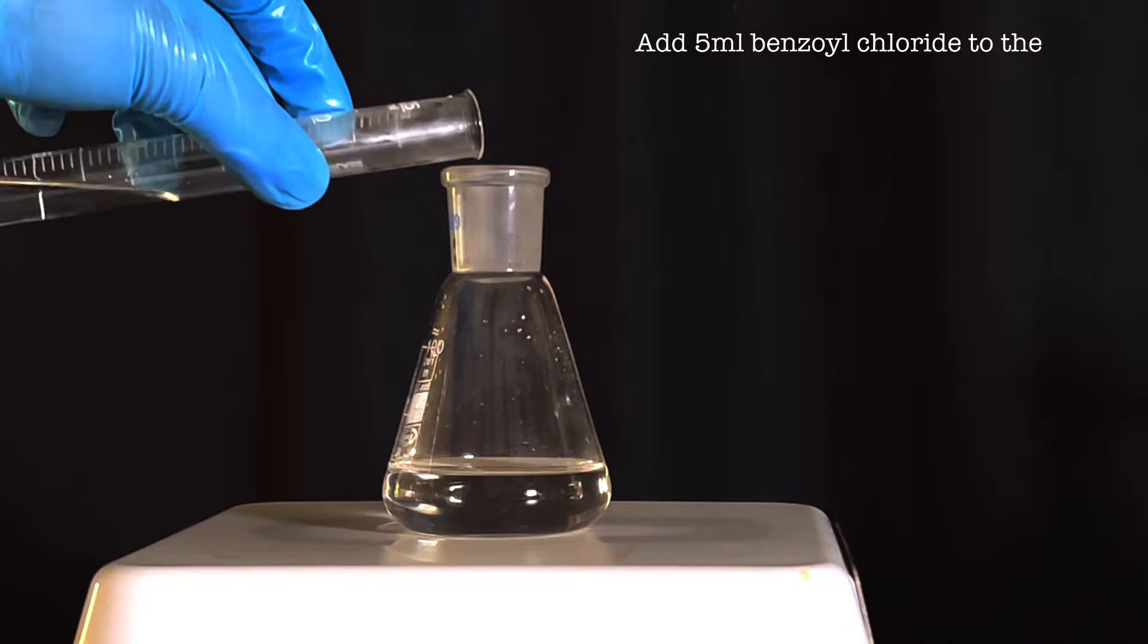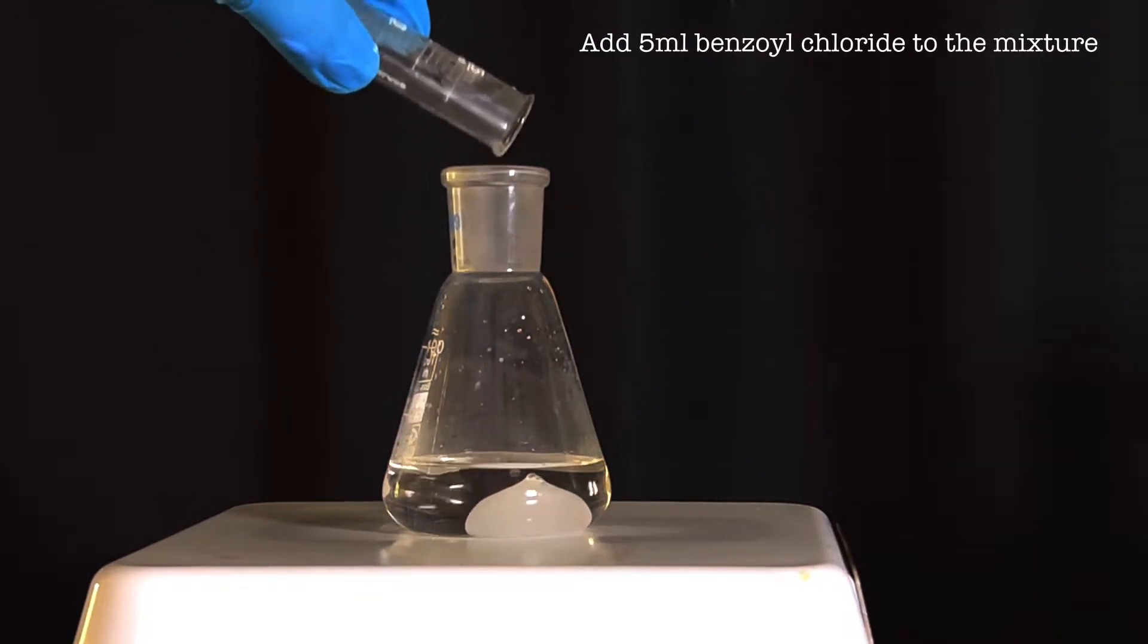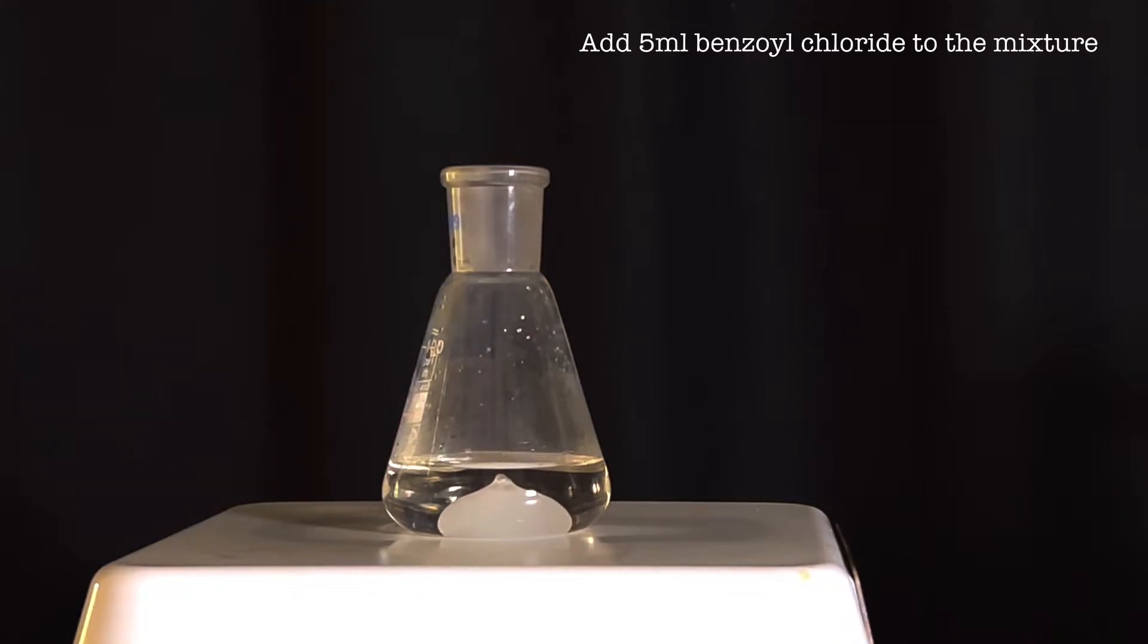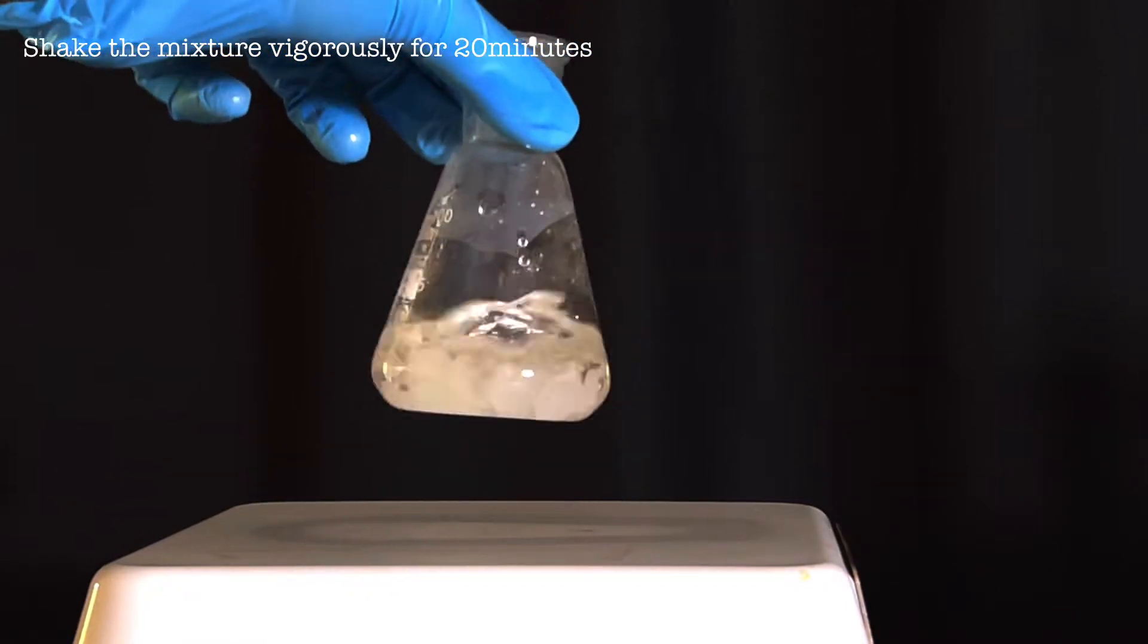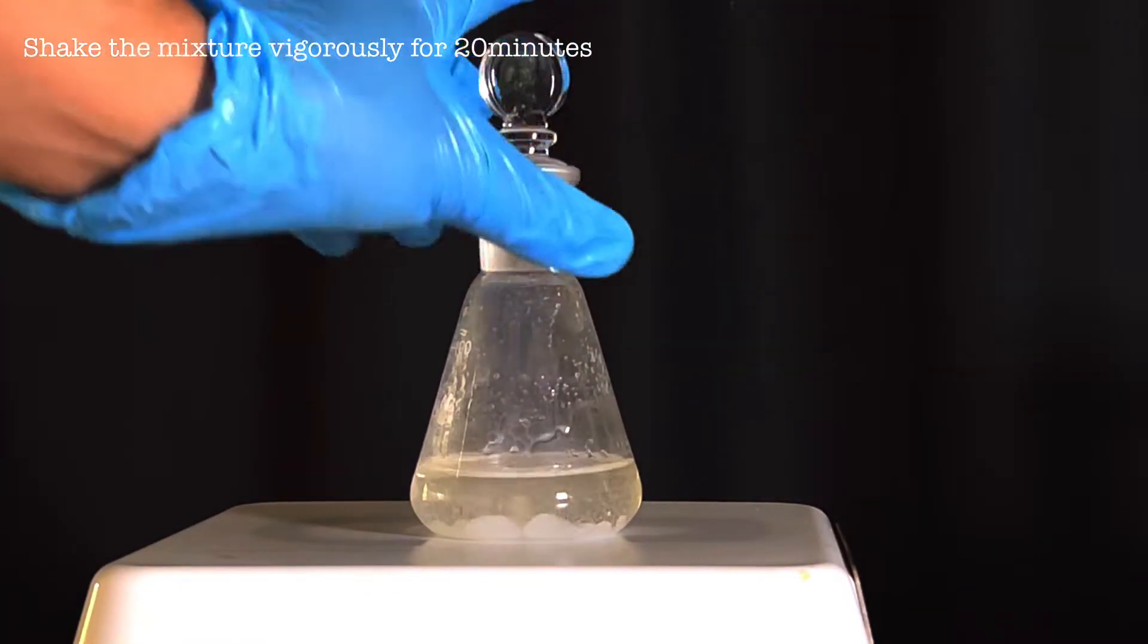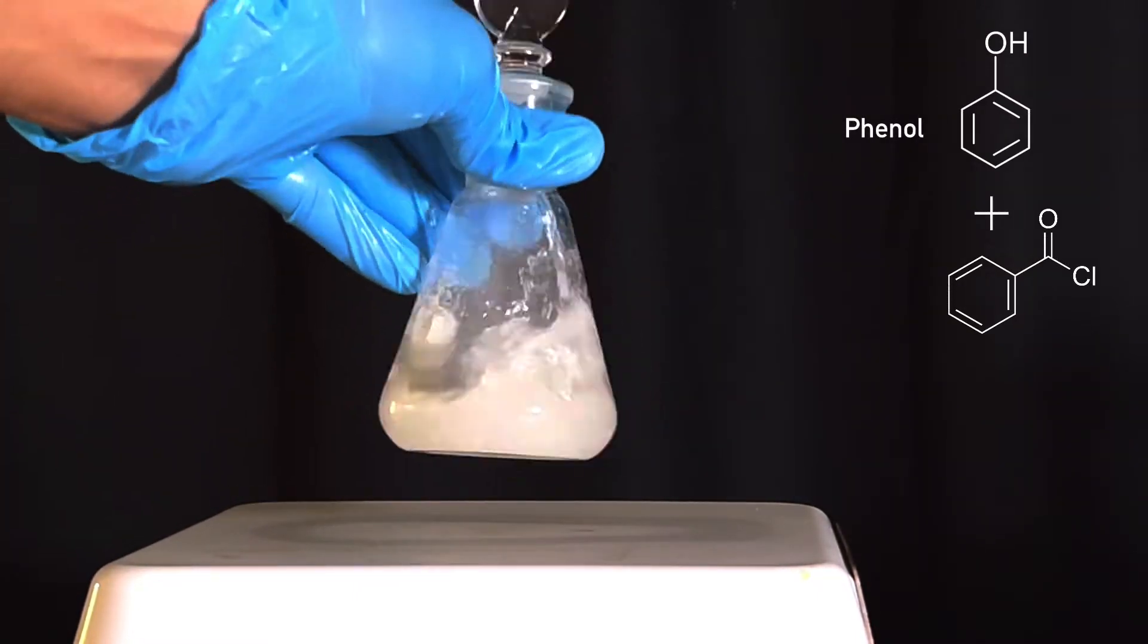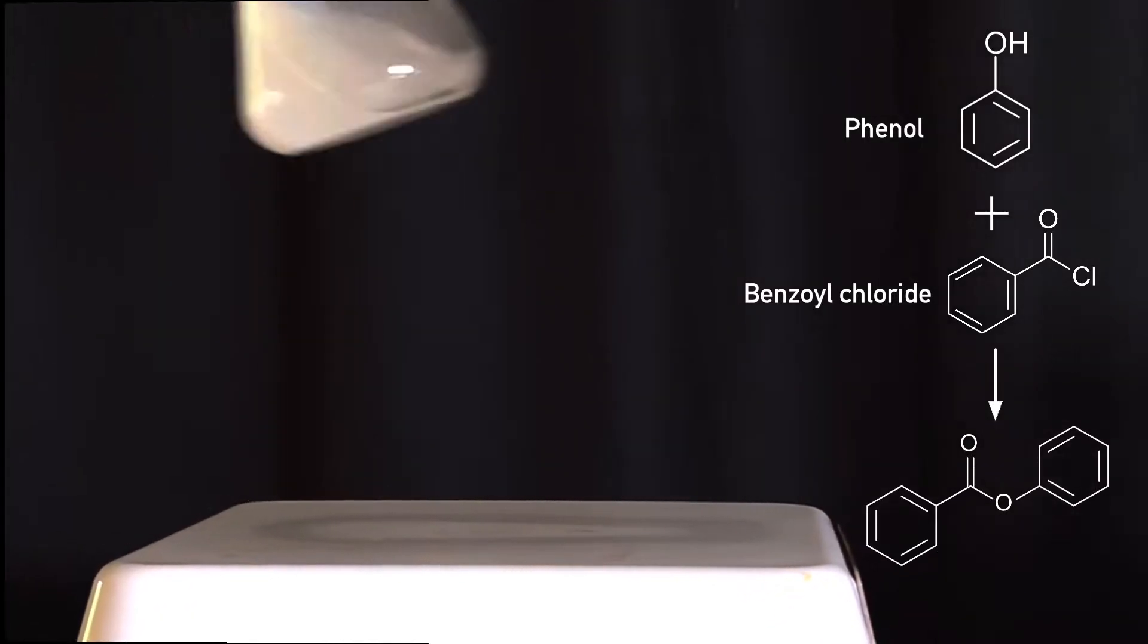Now 5 milliliters of benzoyl chloride was added to the 100 ml Erlenmeyer flask containing the reaction mixture. The glass stopper was tightly capped and the flask was shaken vigorously for about 20 minutes. This causes the phenyl benzoate to form.